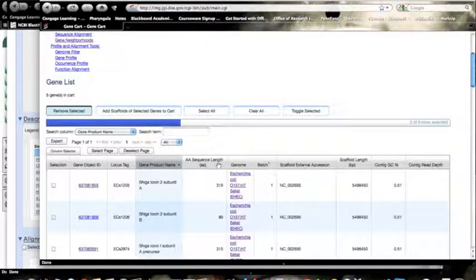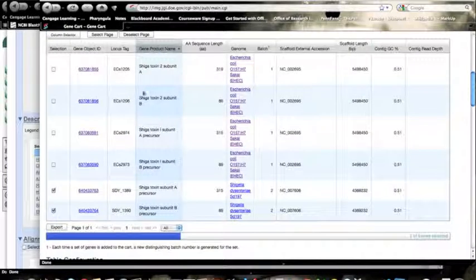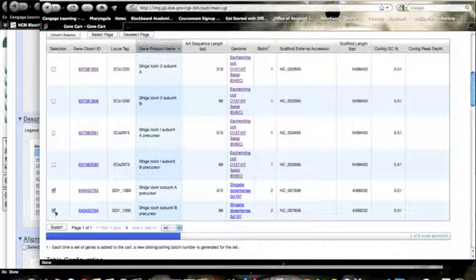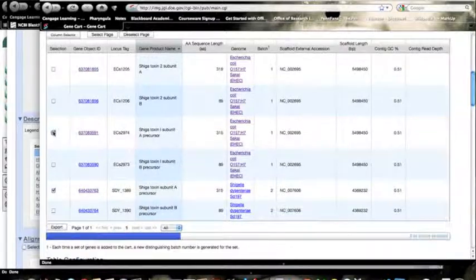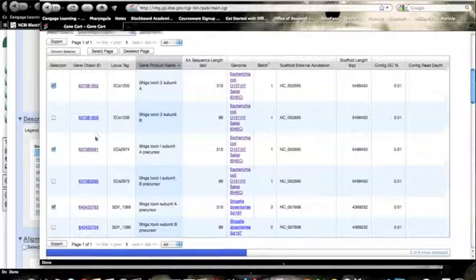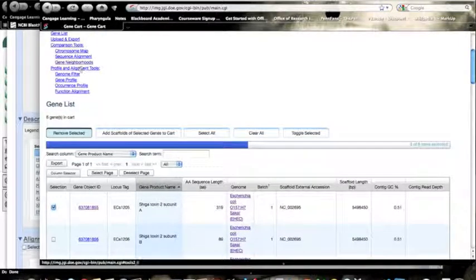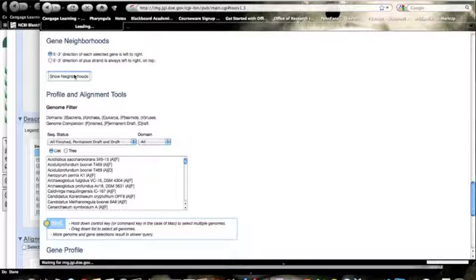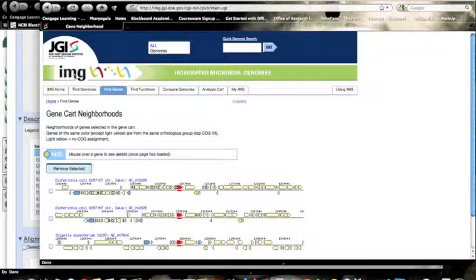And when it comes back, we can compare these with, let's say, let's just look at the A toxins together. A, A, A, and find the gene neighborhoods. And there we go.